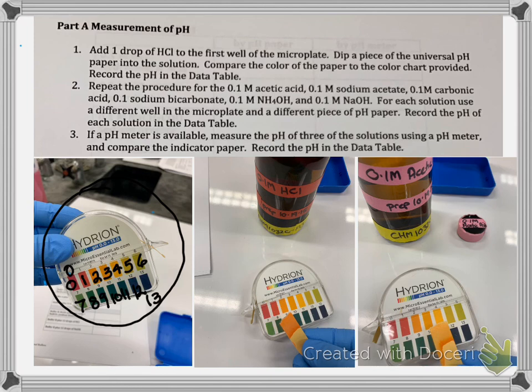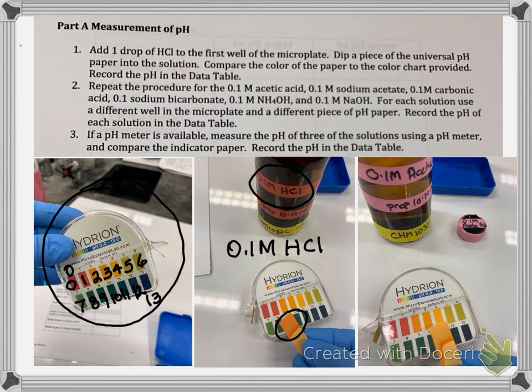So let's take a look. This first sample is labeled 0.1 molar HCl. I'm going to do the first one with you. I would look at the pH paper and try to match it with the colors. Some of the colors look the same, and if you think it's in between, you can put a 0.5, but pH paper is not that precise — we really can't get anything more than 0.5. Looking at this, these two colors match, so this is at position 2. I would say that this HCl has a pH of 2.